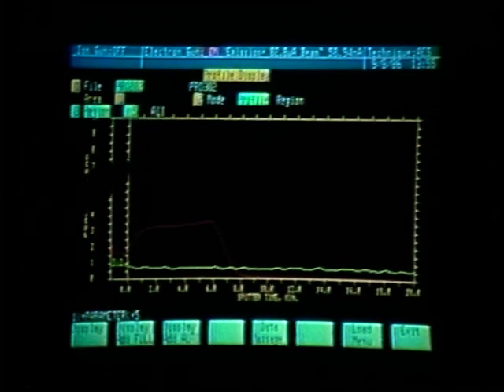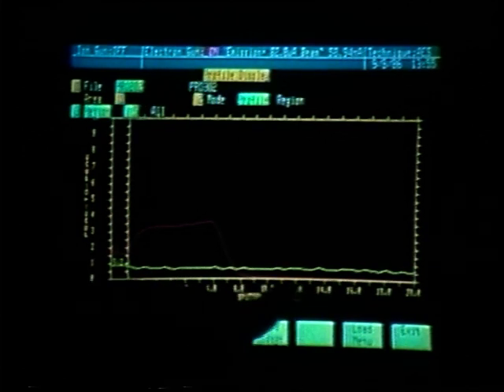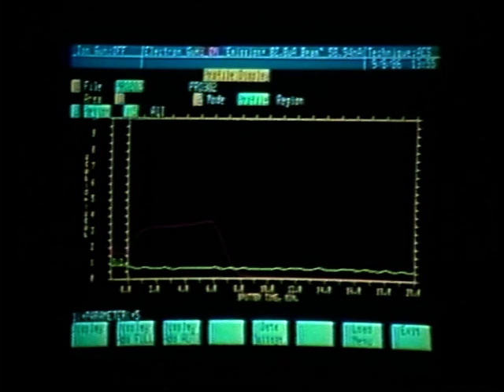Next, we would like to look at individual regions. What we would like to do is, from the profile, evaluate the oxygen peak. According to the profile, we have some oxygen at the surface, but we have more oxygen through the chromium layer, and then oxygen goes to 0 once we get into the copper layer.